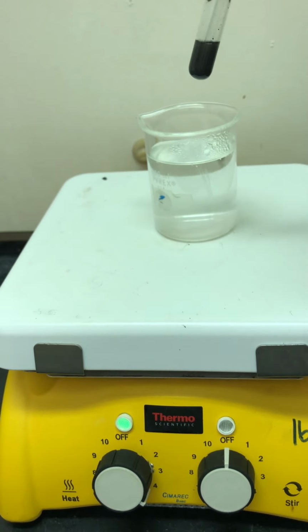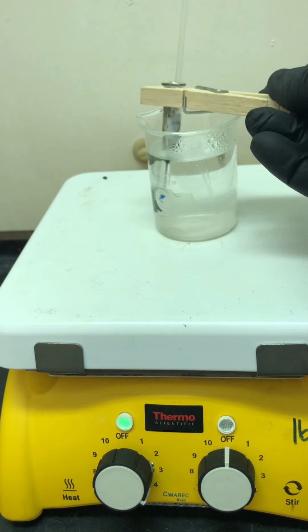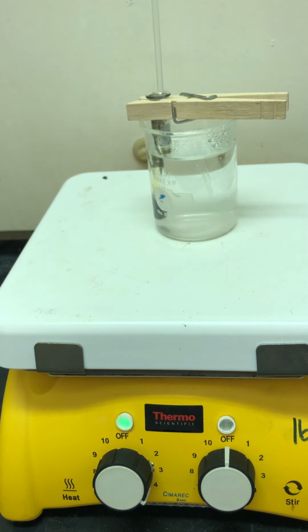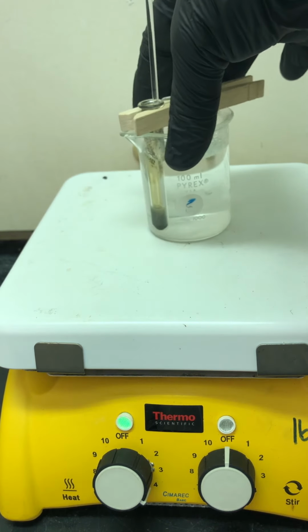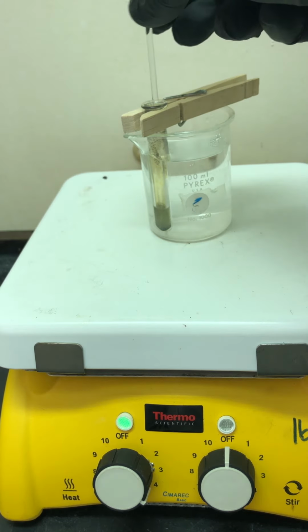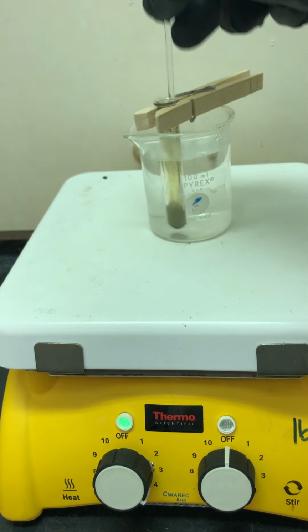boiling water bath, which at this point is not boiling so much. But remember, the idea here is to have it very hot. It's not like you need to have it bubbling all the time. It should be close enough. So we're going to let it sit there for about 5 minutes just to make sure that the heat and the nitric acid do their work in redissolving the pellet. And every now and then, give it a little stir. Make sure you break up those clumps.